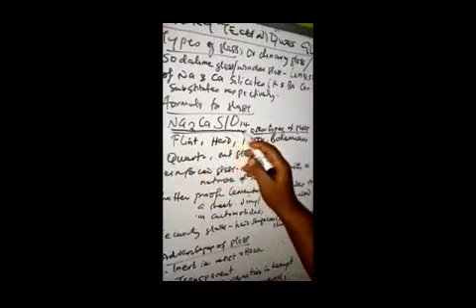So in the exam, if you are asked to write the formula of glass, this is what we are going to write. Apart from this ordinary glass, there are other types of glass. Like the flint glass, the hard glass, the Pyrex glass, the Bohemian glass, the quartz glass, or the out glass. Some of these glasses, you can also treat them to be used for another thing.